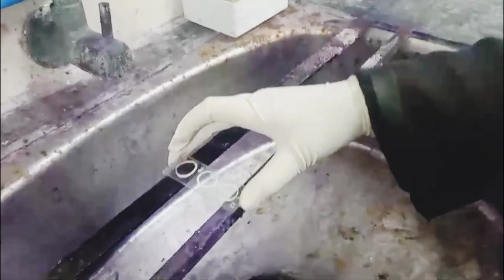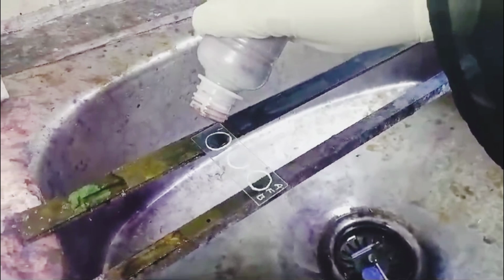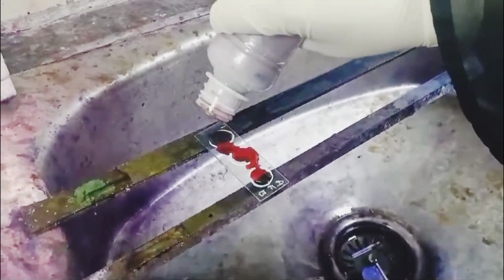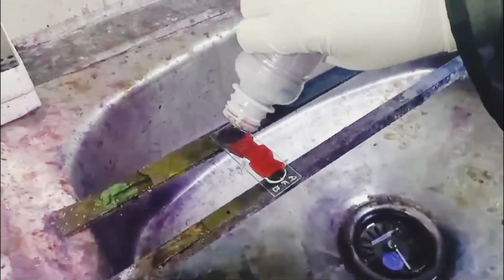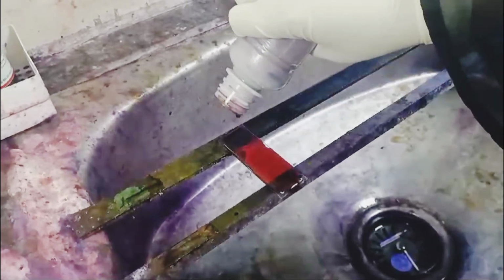Guys, we are processing the AFB stain. Let's see how to process the AFB stain. This is carbol fuchsin. Pour this on the slide. AFB stain is used for Mycobacterium tuberculosis and Mycobacterium leprae. Pour this completely on the slide.